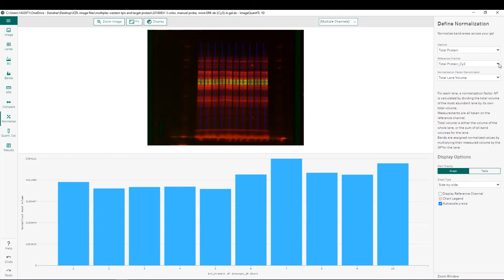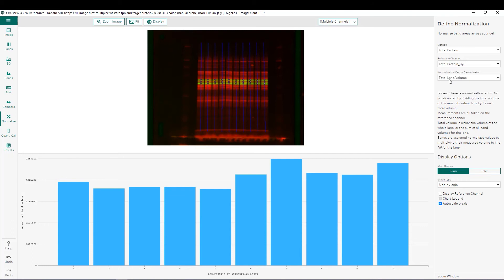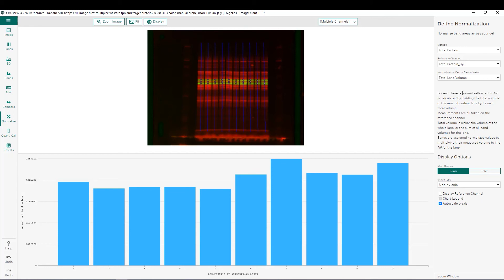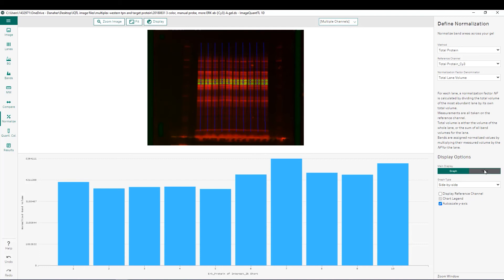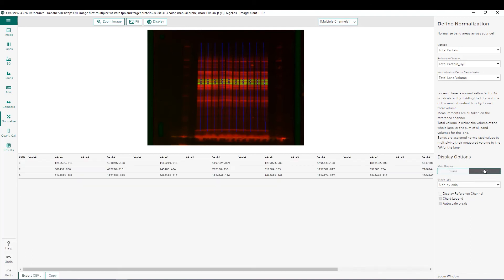Once you've chosen your method you simply have to choose the reference channel, in this case it's going to be the Cy3 channel shown in red, and finally we have to choose which normalization factor denominator we'd like to use. So you have options for total lane volume or total band volume. In this case we're going to use total lane volume so that we don't have to identify individual bands within the cell lysate that we're normalizing to.